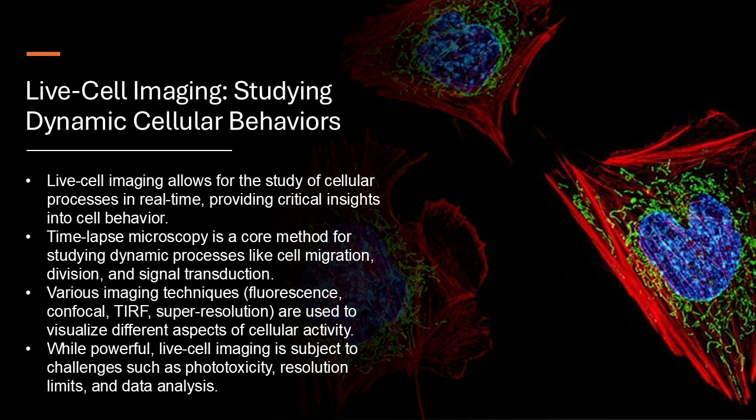It is. How is that even possible? It's complicated, but these techniques use clever tricks with fluorescent molecules and advanced image processing to create amazingly detailed images far beyond what was previously thought possible. So we're not just watching cells move and divide anymore. No. We're seeing the individual molecules within them interacting. That's right. It's opening up a whole new world of understanding about how cells work at the most fundamental level.